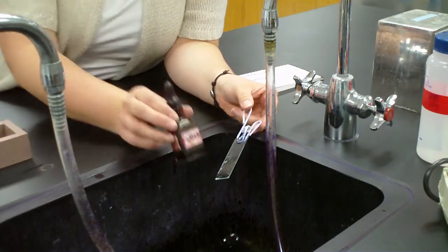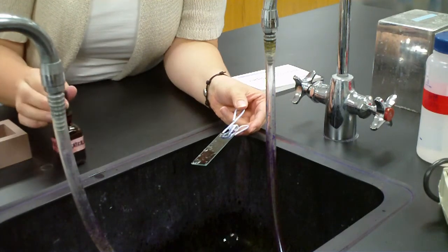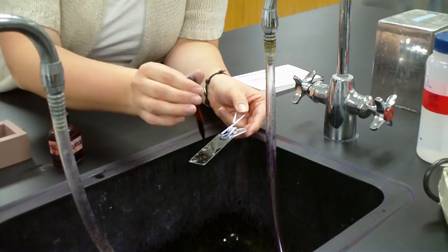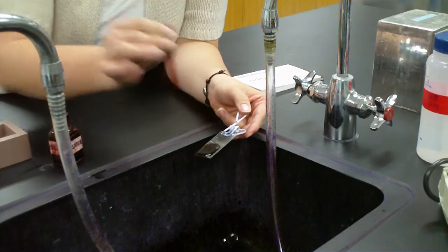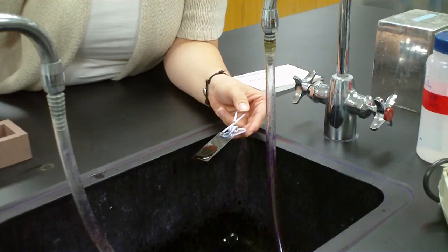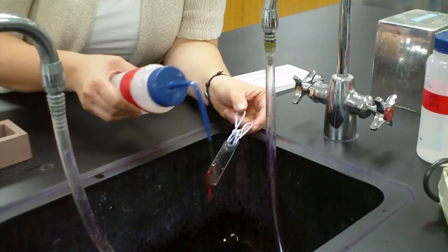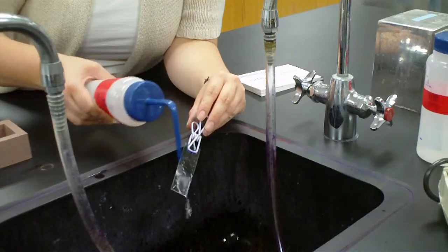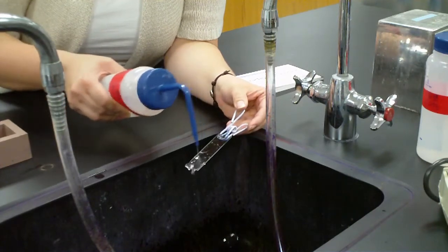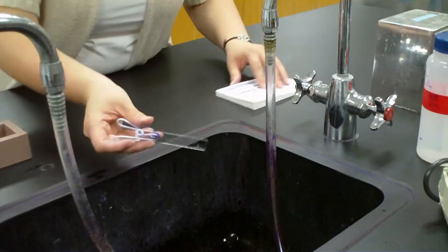The next step is our safranin, and so we're going to let the safranin sit after we washed off that decolorizer. I'm going to let the safranin sit for a minute. So I flood the slide. I would let that sit for a minute. That's my counter stain. And once that minute is up, I'm going to rinse on both sides. And so at the end, I should have my slide stained pretty well.